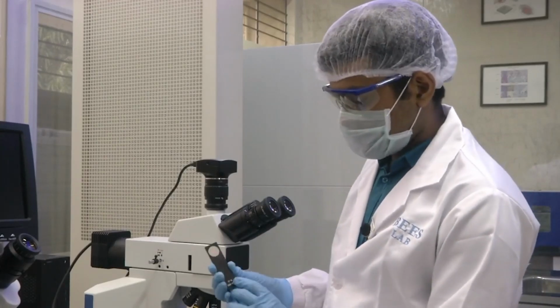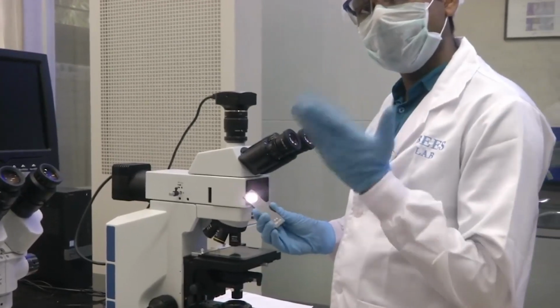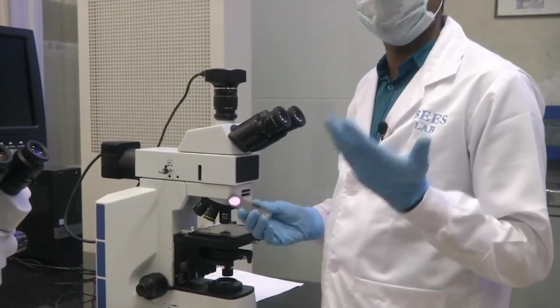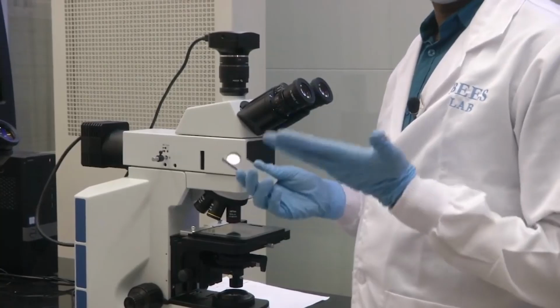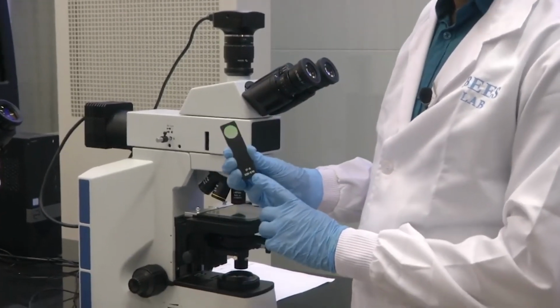So here if you see, this is green filter. Again, green falls in between blue and yellow. So as from your school days you might have studied about VIBGYOR: violet, indigo, blue, green, yellow, orange, red, VIBGYOR. So this is green, 520 to 570 nanometer.